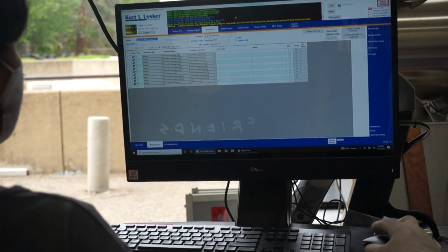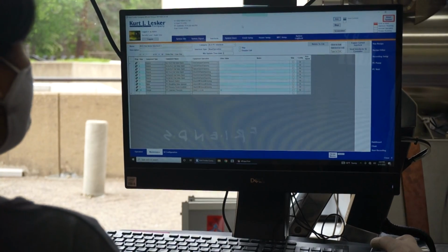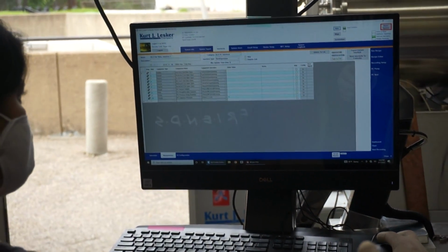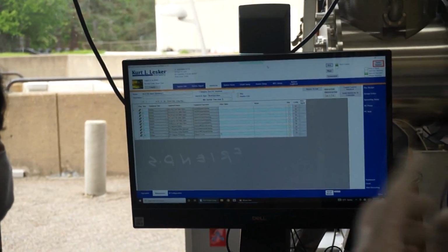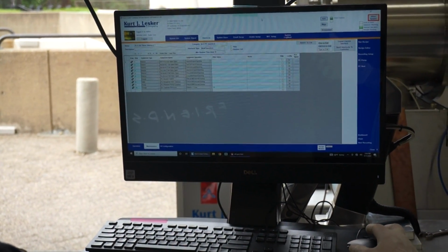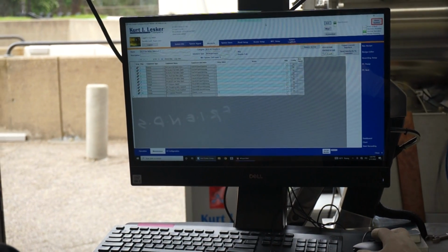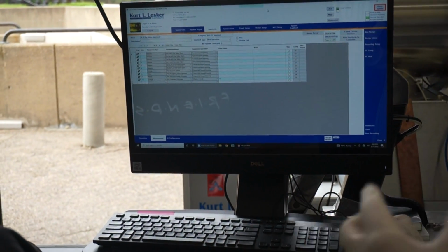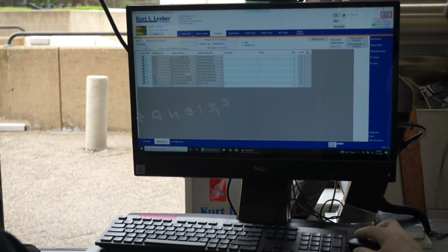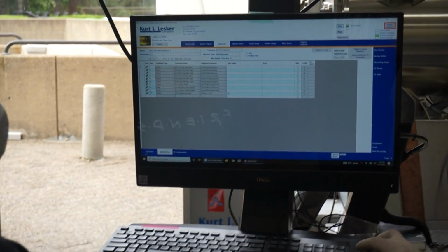So you can acknowledge it, and it all goes away. Now, if a user trips something, and they acknowledge it and it goes away, it doesn't mean there's not a history of it. The history of it stays in an archive. I'm not showing everybody where that archive is, for obvious reasons. But it's captured. So we figured out, oh, okay, the valve was open.